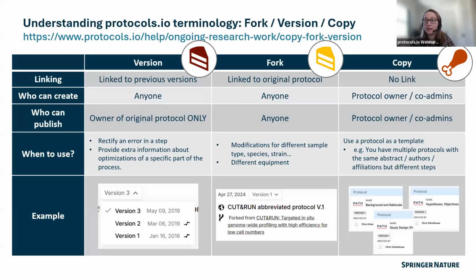And then a copy would be if you're working in the same kitchen with the same chefs, but you're making a completely different recipe like fried chicken, you would make a copy and you would have some similarities that are retained, but changing all of the steps.